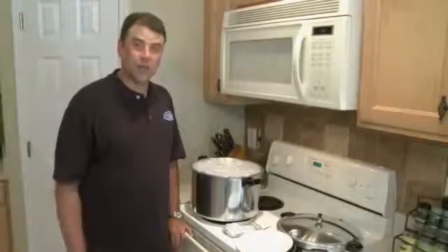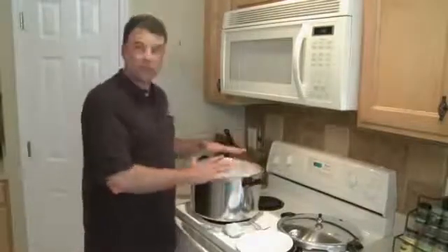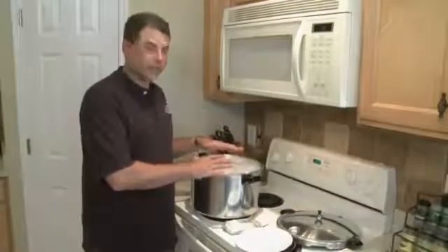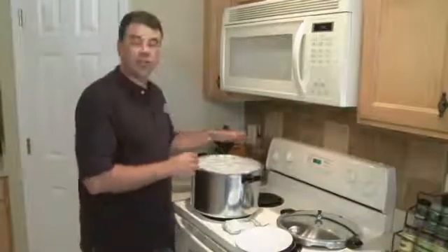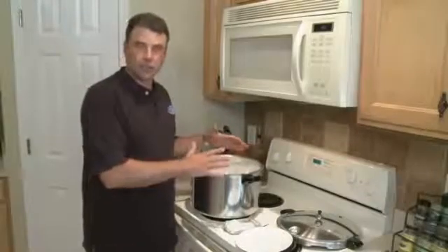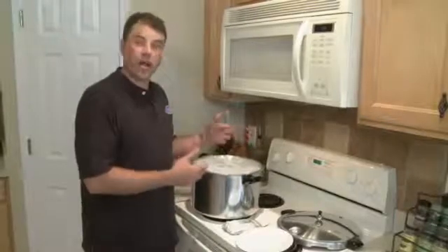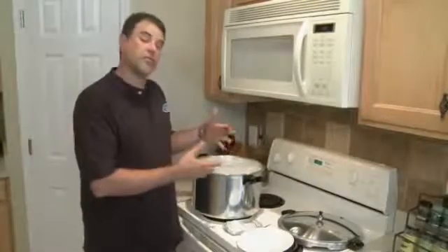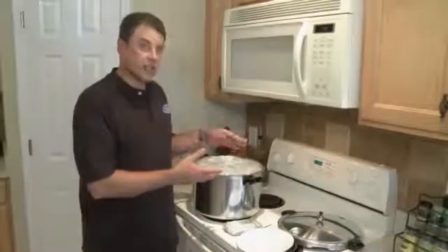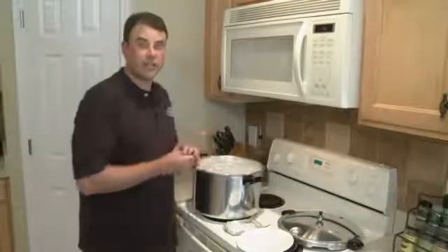Now we've moved everything over to the stovetop. I've got my pressure cooker assembled with all of the filled vessels stacked inside of it. I've gone ahead and started the heat because I want to warm this up. This thing takes a little while to get warm, and as long as we're over here I wanted to show you how I like to fill it, because as long as we have a sterilizing cycle I can go ahead and put in some of the other items that I'd like to sterilize at the same time.